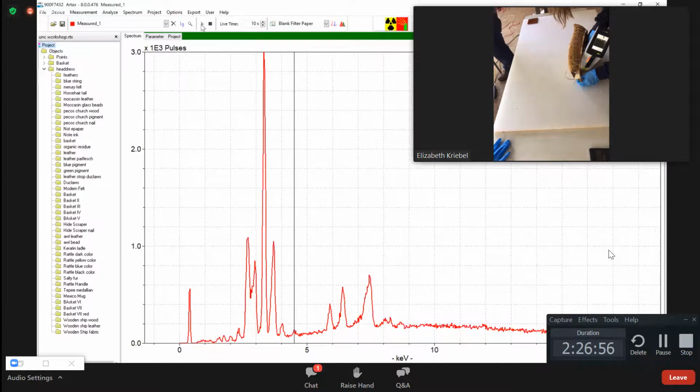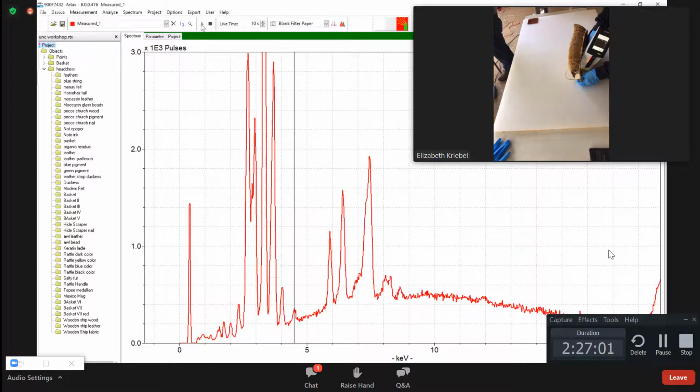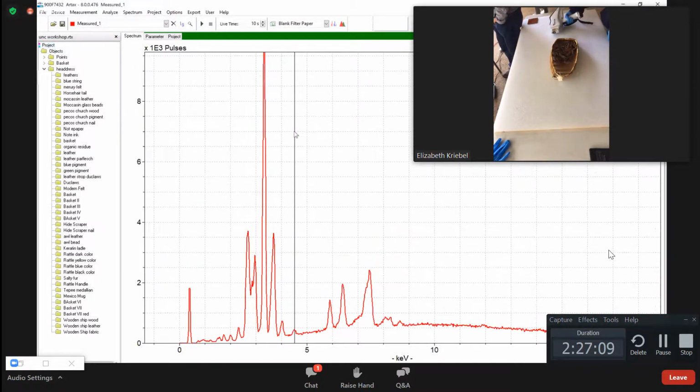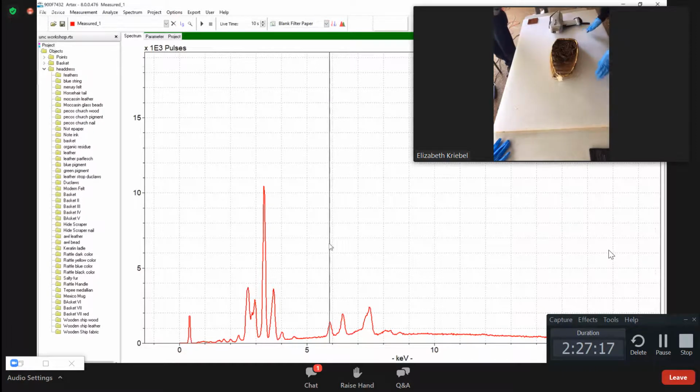And what is this, just on the side? Yeah, just the side. All right, nothing toxic. Great. Maybe a little bit of chlorine, but other than that, nothing unusual for wood. A lot of manganese, but to be honest, I don't think that would be introduced by humans. Different species of plant have different levels. We really should have measured some tea with the coffee, because tea has tons of manganese, since the plant needs that as an essential nutrient. So whatever species was used in this needed manganese.